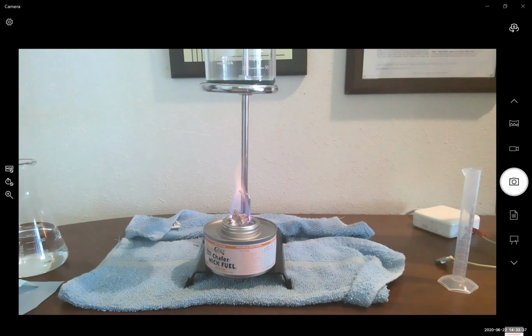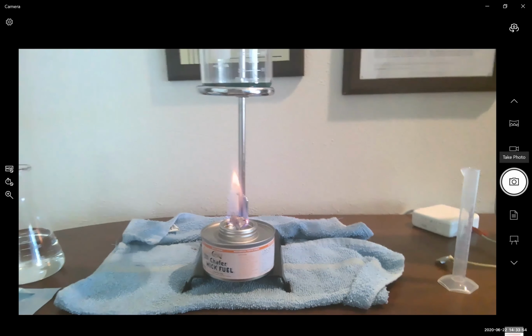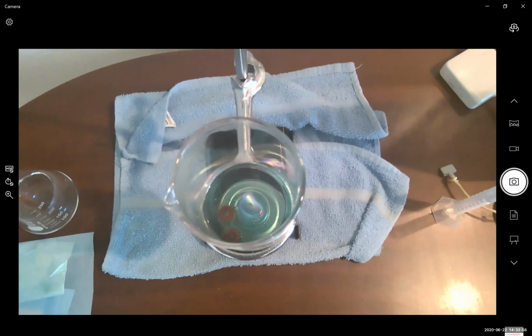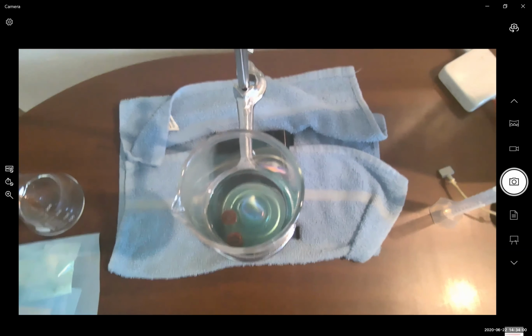We have about 2 minutes until we're going to cut the flame. Let's just take a look at our solution now, and as you can see, we've undergone a pretty dramatic chemical reaction.